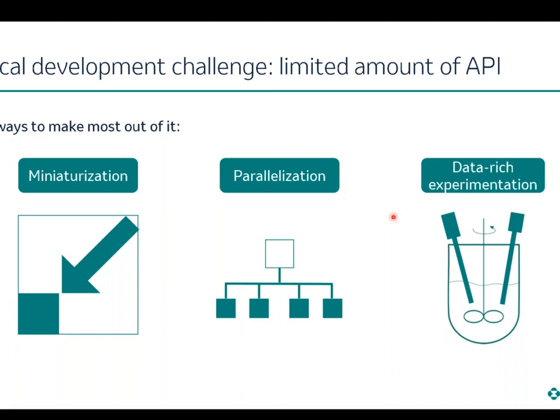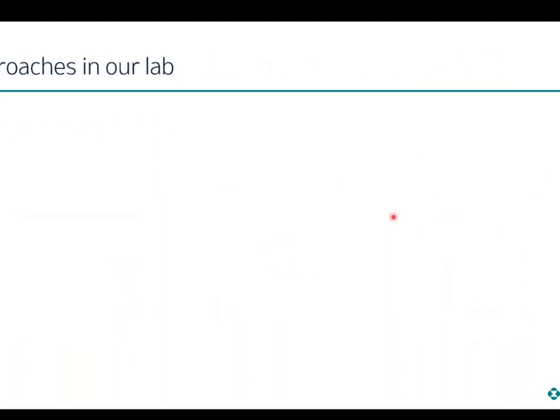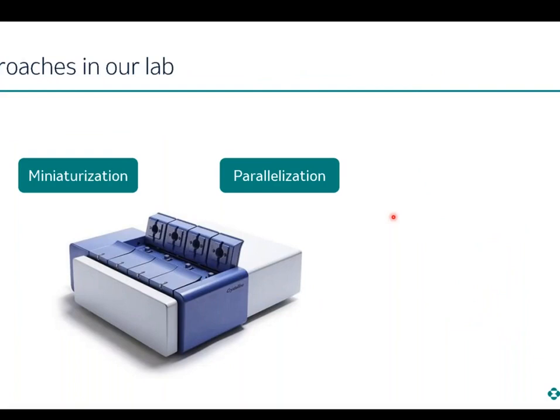So for us at MSD, we have the following approaches that we've come to for miniaturization and parallelization at small scale. We're using the Crystalline system, which provides overhead stirring, anti-solvent addition with external pumps, and temperature control. The system also allows for imaging as well as a turbidity probe.